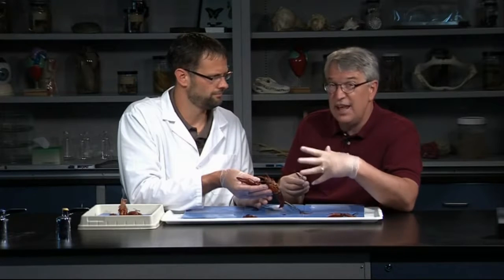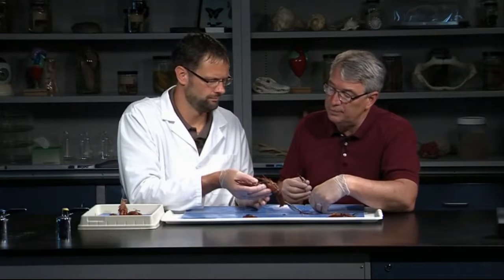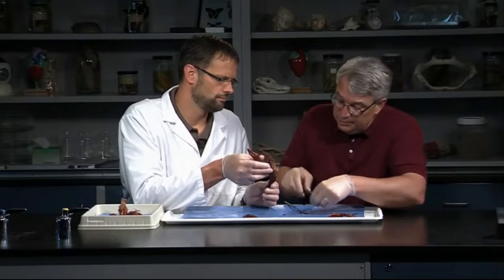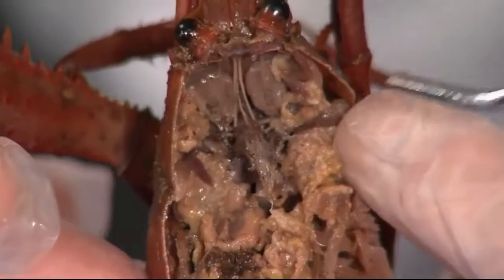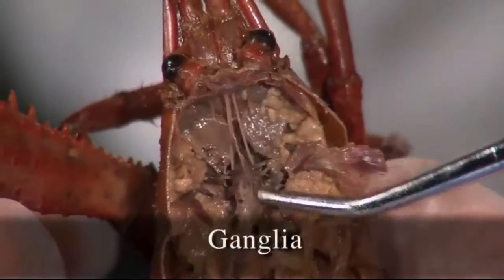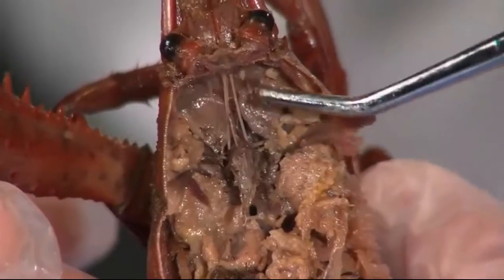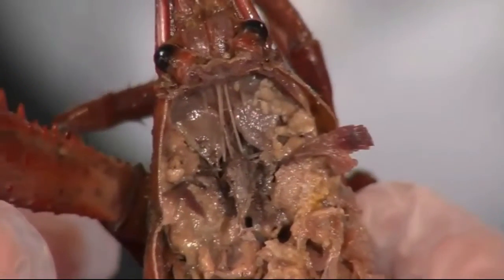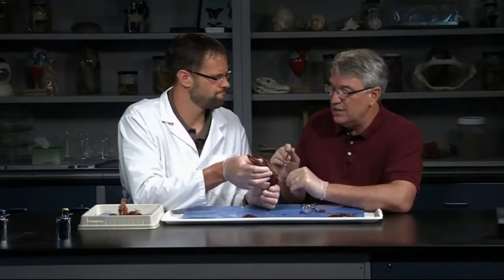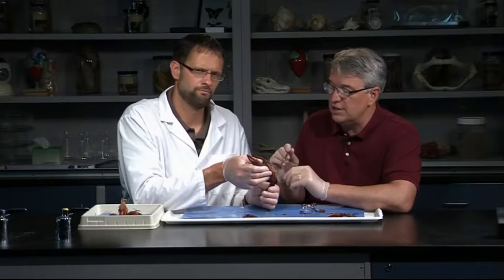These animals don't have really large brains. Most of the control is out in the segments — what we consider peripheral control. What we can do now is actually take that stomach out of there. Here's one of those ganglia right here. Here are the two nerve cords coming down from the eyes, and they actually go around the esophagus — they're called the circumesophageal nerves. What passes for a brain would be right here in a crayfish, and it's pretty small. They're pretty amazing at what they can capture prey — very instinctive. It's a sophisticated nervous system that functions very well, but they just don't have that level of central processing that we think of in vertebrates.